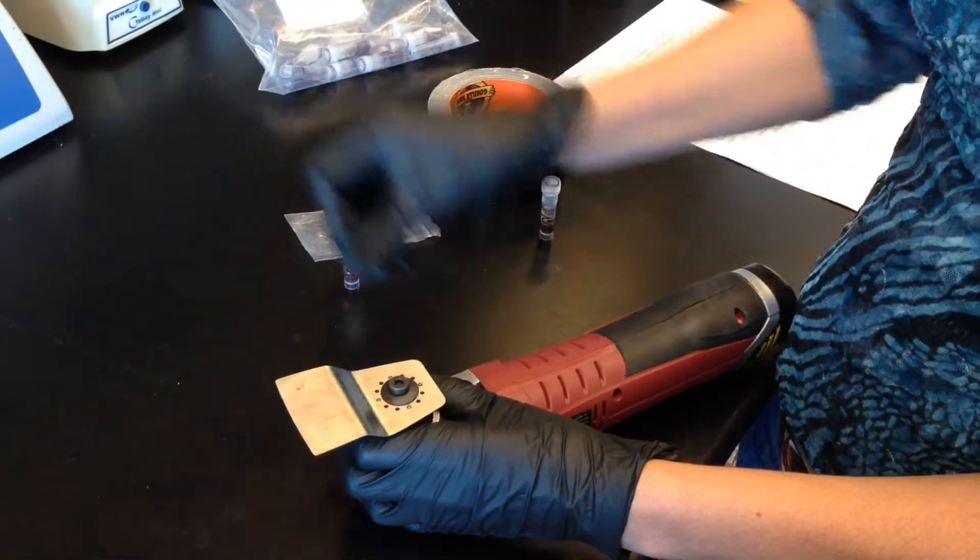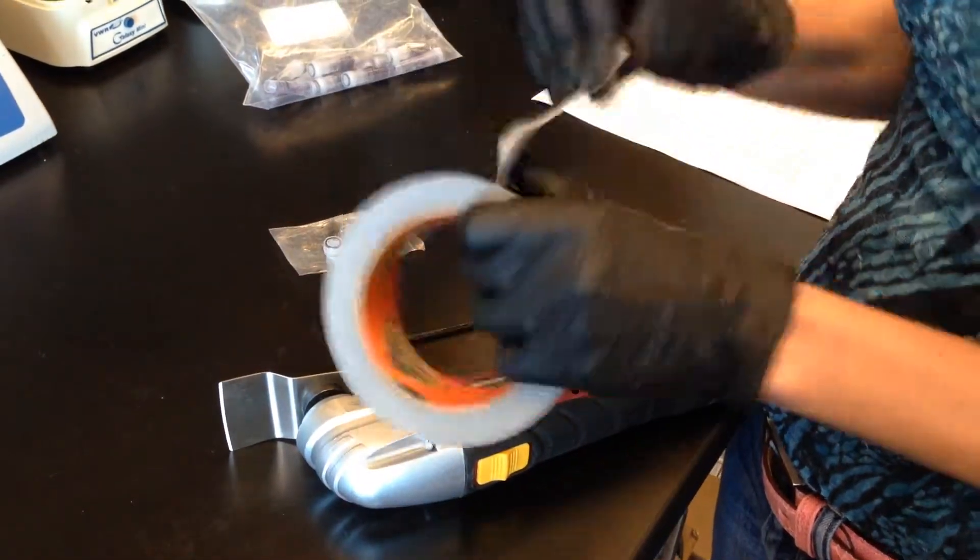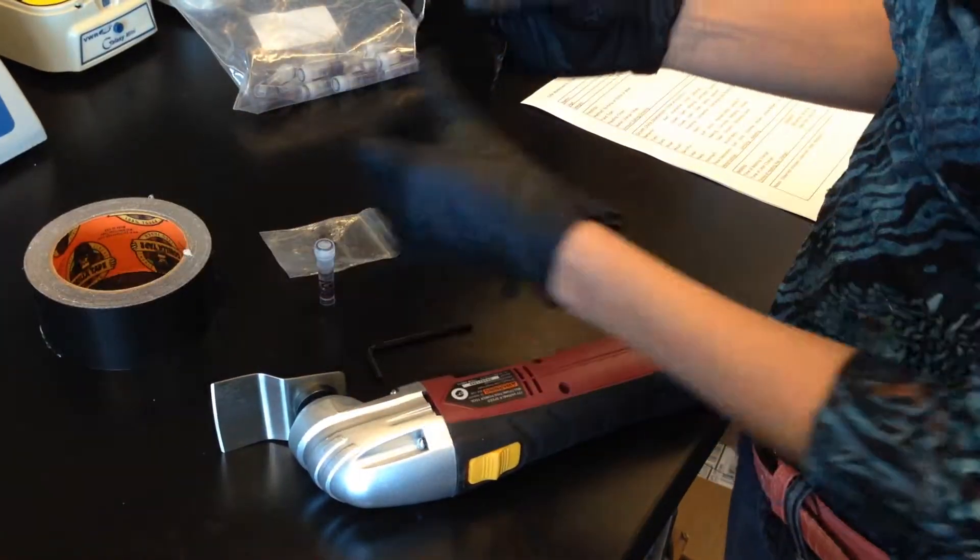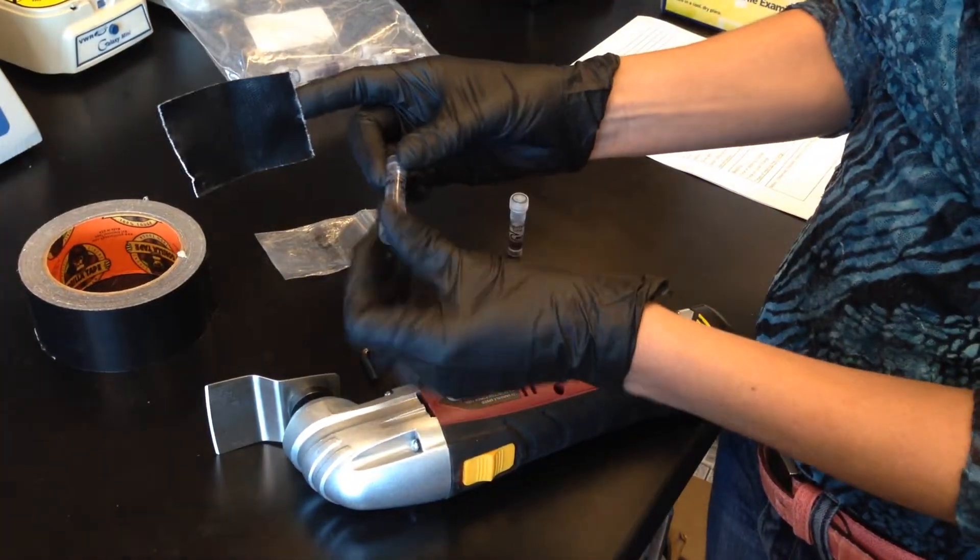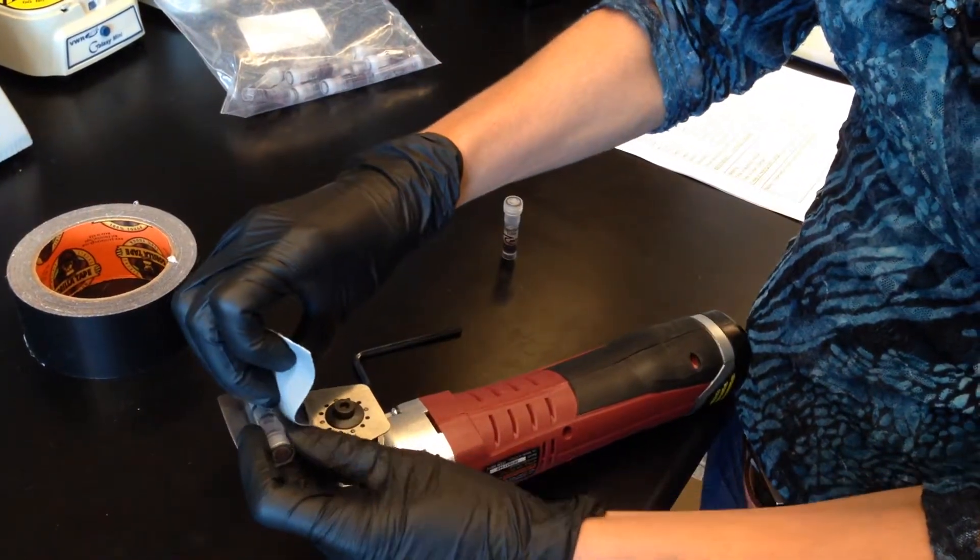You use this to tighten it, and then I'm just using this really strong duct tape—this one's called Gorilla Tape—to attach the Powerbead tube to the device.